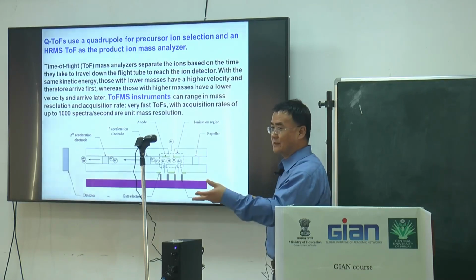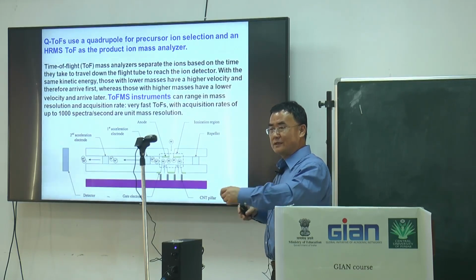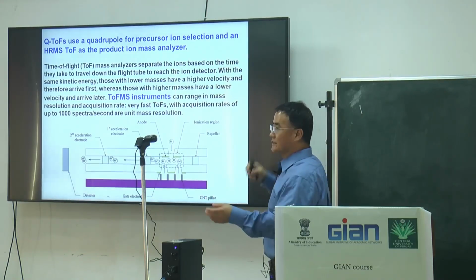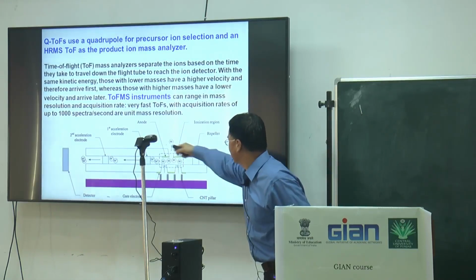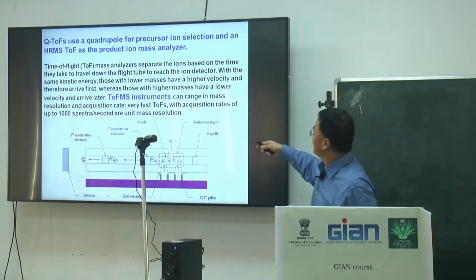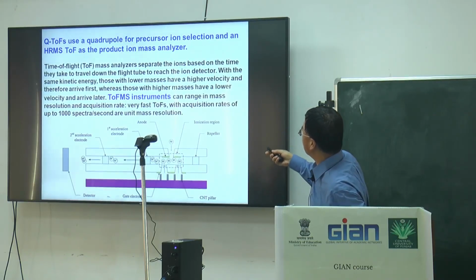The sample is quickly evaporated at high speed, and is charged in the electric field. Then through long flight, according to time of flight, the mass analyzer separates ions by weight.